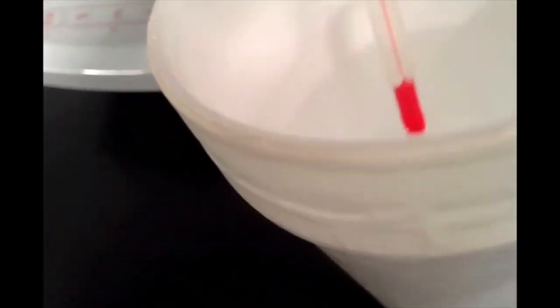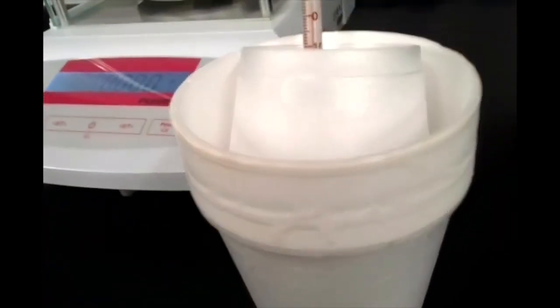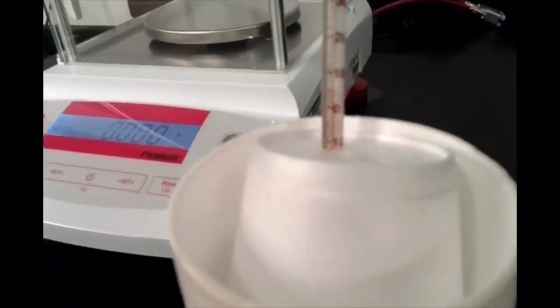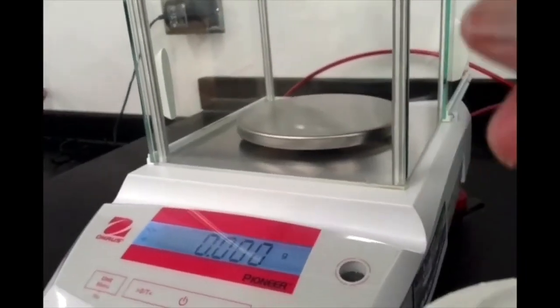It doesn't look like we have any ice left. Oh, maybe a tiny little bit. It's kind of hard to see because it's getting a little translucent. Let's see. Hopefully it will drop down. I might add another cube just to get the temperature down a little bit more. And let's add one more cube of ice, because why not? One little cube. Oops, let's set that down so I can use both hands.